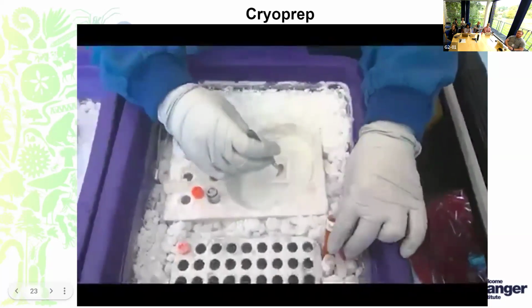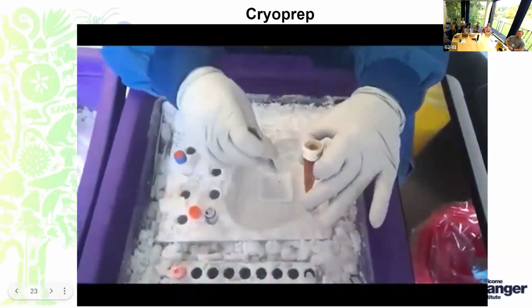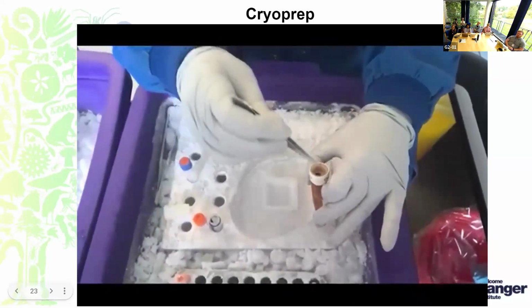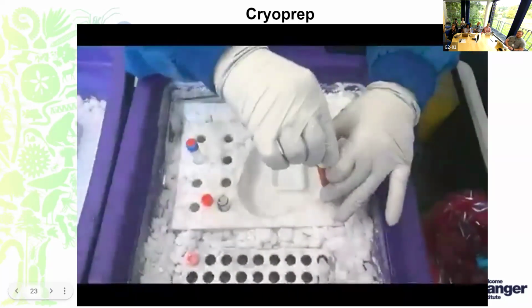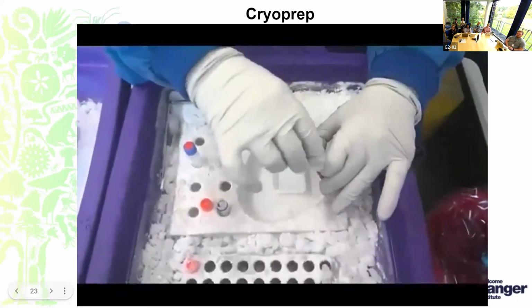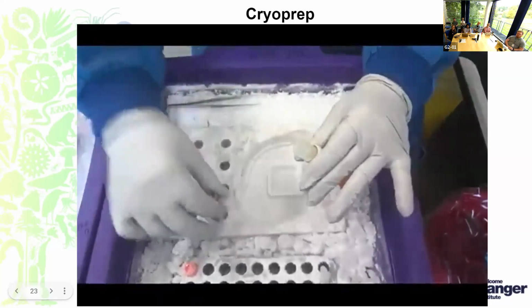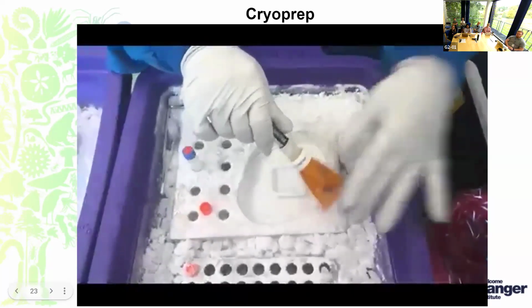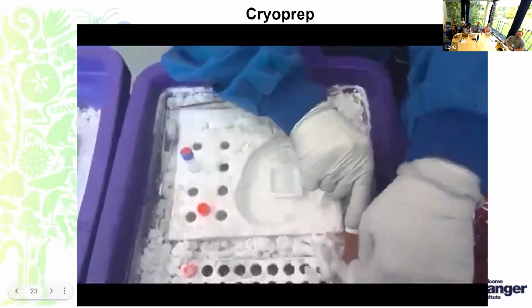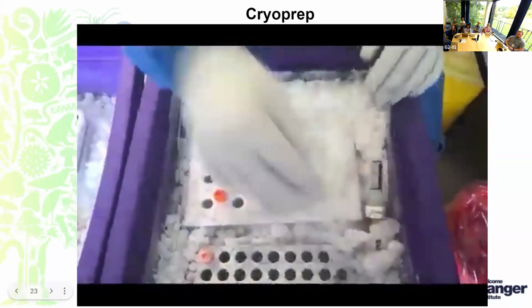Once we get the required weight for the cryoprepping process, we transfer the sample into these specialized cryo bags, and we make sure we maintain the entire process on cold racks. The setup is then combined with an adapter, which will then be adapted to the Fluidx tubes from where the sample was taken. The entire setup will now be immersed in dry ice so that the cold temperature is maintained even after the transfer into the cryo bags.